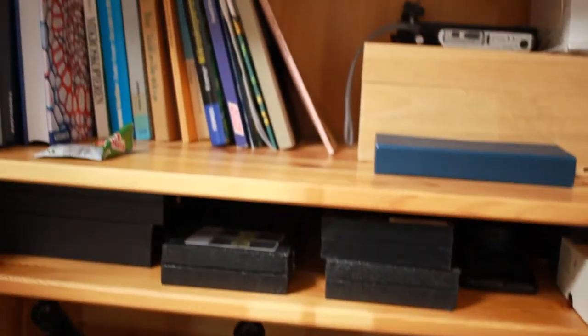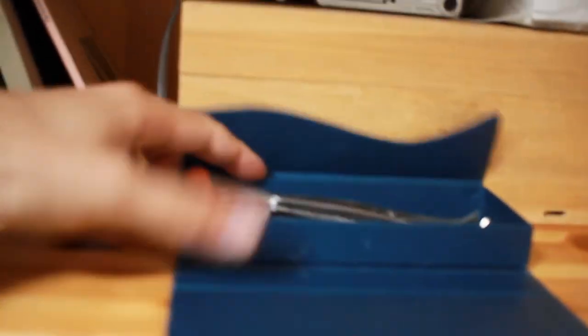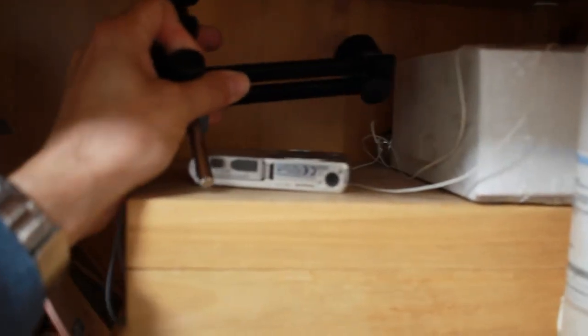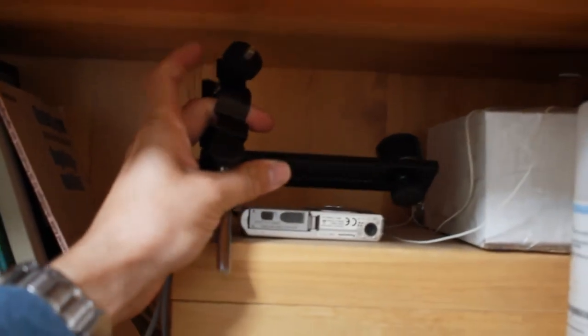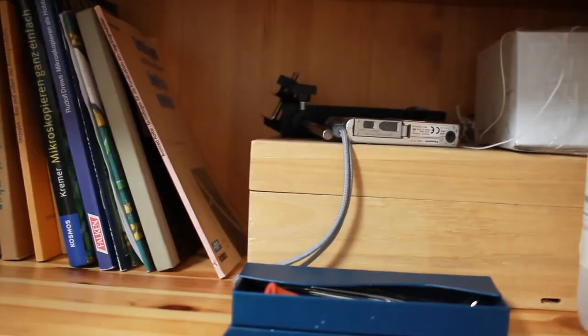And then, of course, the things I have on the table. I also keep some tools in here, the tweezers and so on. It's again a little bit out of focus, but I think you get the idea. This one is a very good one, by the way. This is a mount for small cameras on a microscope. That's a really good one. I can highly recommend that.